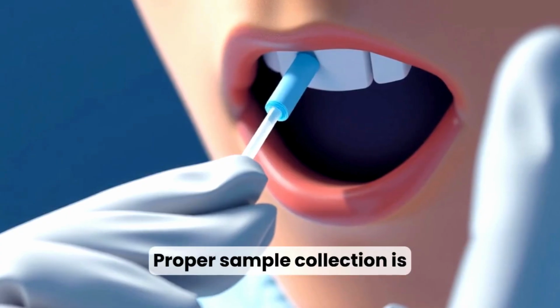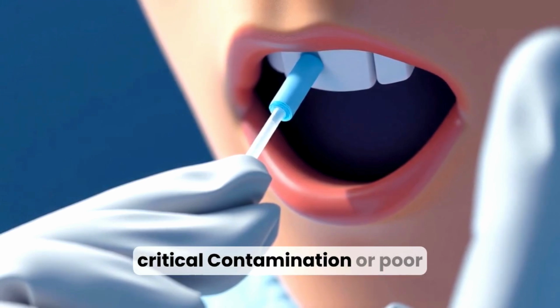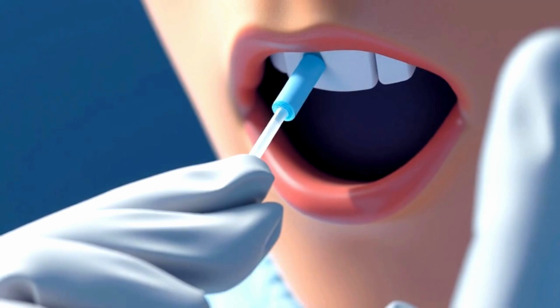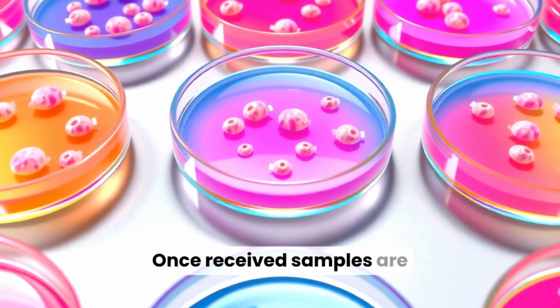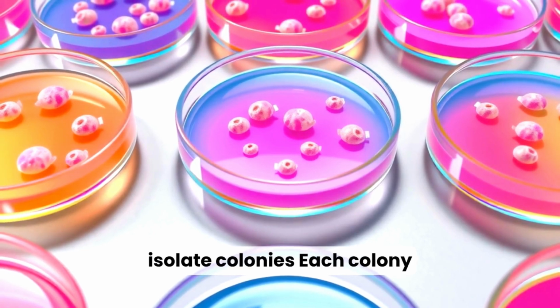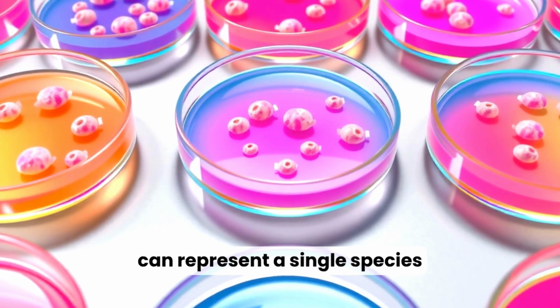Proper sample collection is critical. Contamination or poor sampling can lead to misleading results and wrong treatment. Once received, samples are plated on appropriate media to isolate colonies. Each colony can represent a single species.